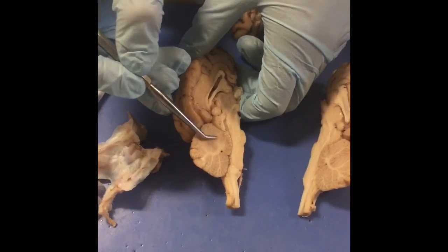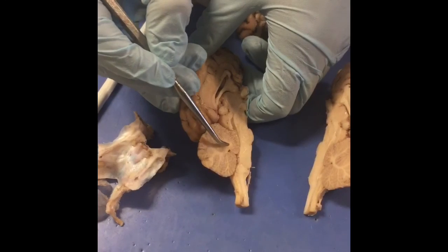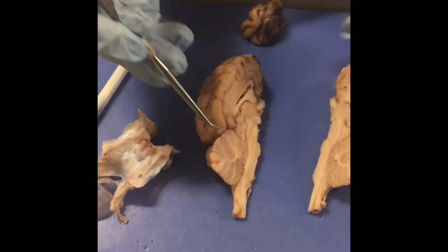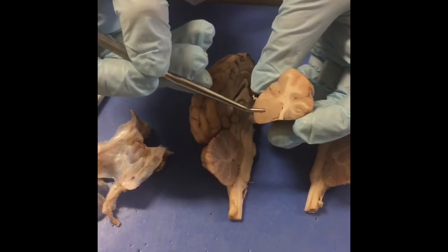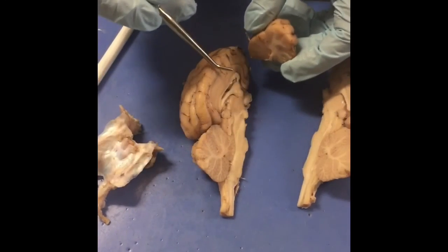On the cerebellum, we have the arbor vitae, which is this tree-like structure right here, which is also called white matter, and this being the gray matter. And then if you do a transverse cut of the frontal lobe of the brain, on the cerebrum, we have gray matter and white matter also. The end.